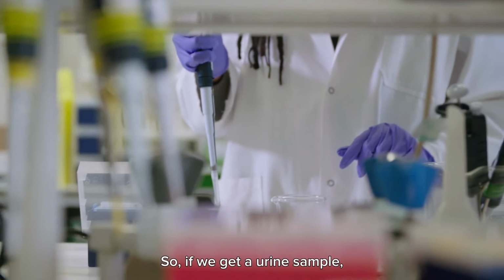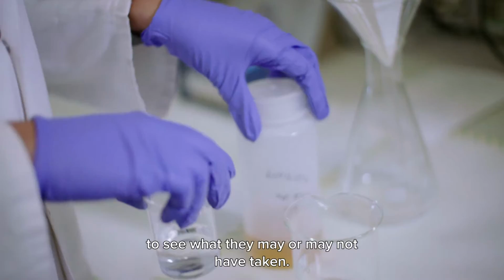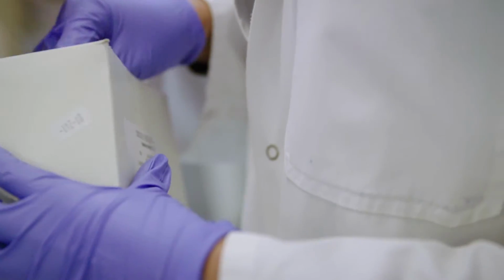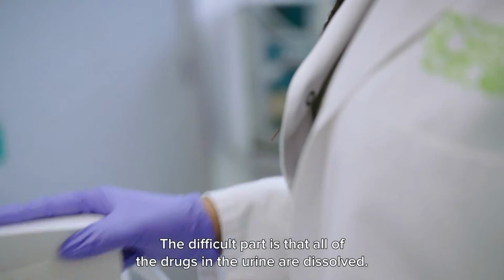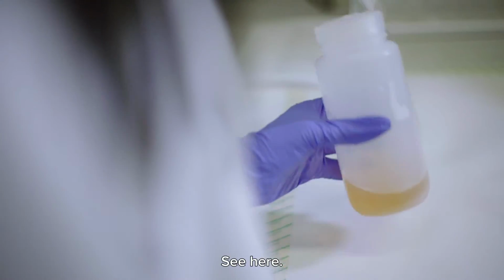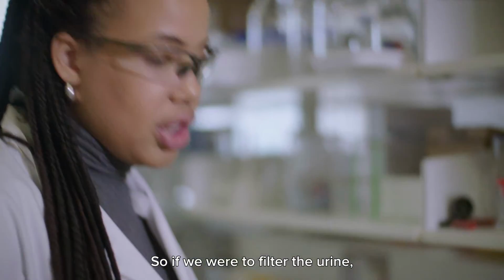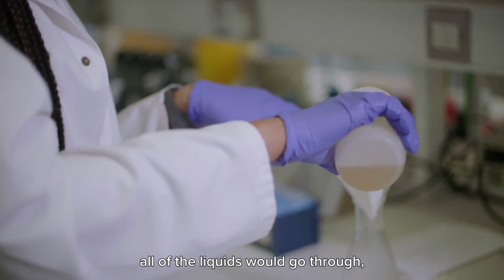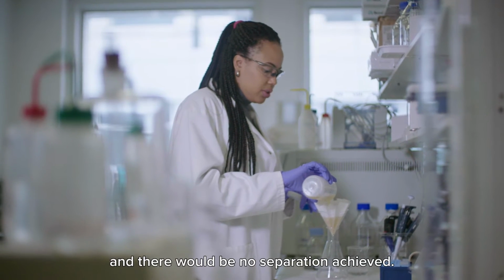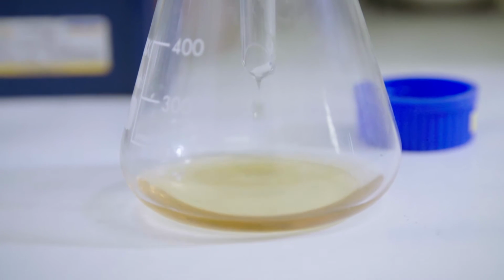So if we get a urine sample, we can then separate out the different components to see what they may or may not have taken. The difficult part is that all of the drugs in the urine are dissolved, see here. So if we were to filter the urine, all of the liquids would go through and there would be no separation achieved. And you can see everything's coming through.